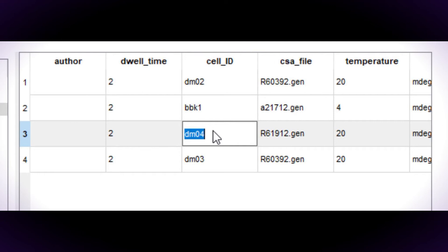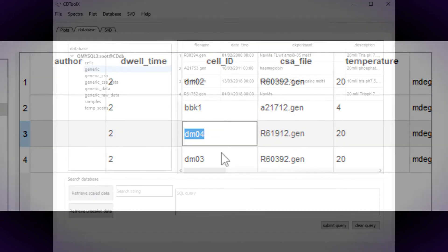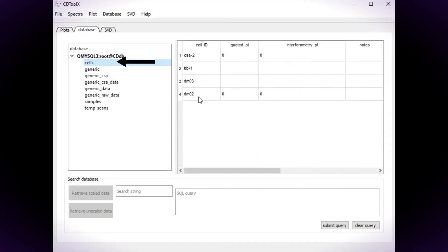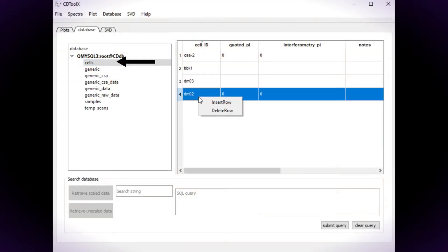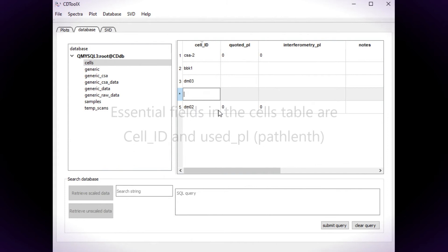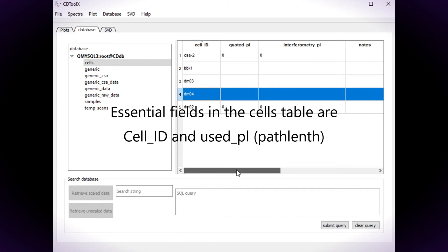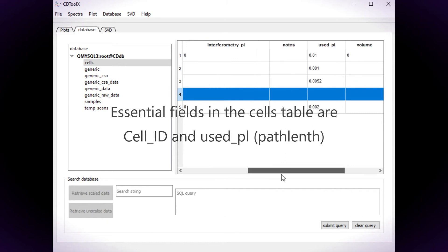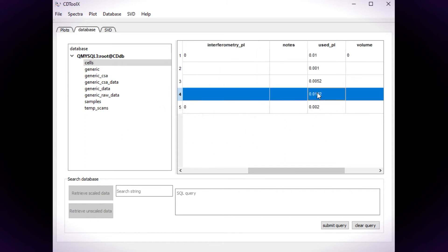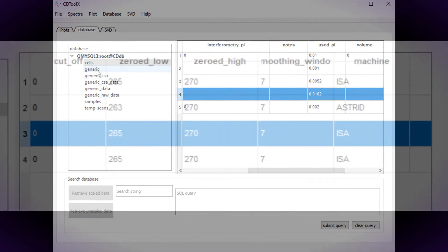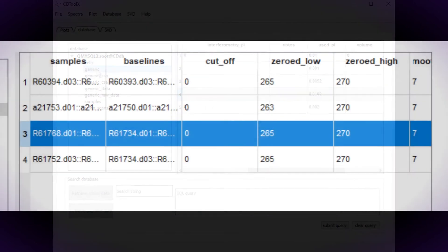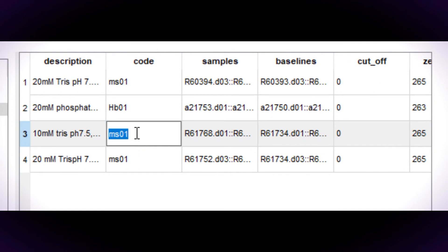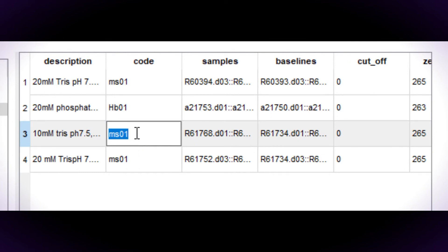This particular cell is not in the database so the cells table will need updating. Right click and choose Insert Row. Similarly, the mean residue weight is found in the samples table linked by the code field in the generic table.